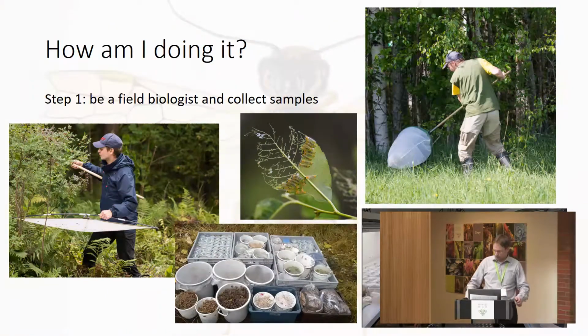Just to quickly present how I am doing it, what is very important to tell at this point is that this protocol can be, and has to be, modified for different groups. Sawflies, for example, are medium-sized, not usually very small. When we are dealing with extremely small specimens, we have to do some steps in a bit different way.